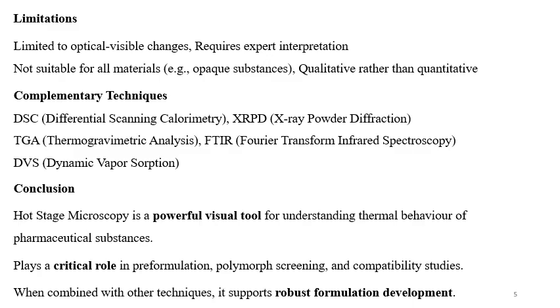It is limited to optically visible changes. It requires expert interpretation because it is a qualitative type of technique. So, the sample should be analyzed repeatedly, and it requires expert interpretation. It is not suitable for all materials. It is qualitative rather than quantitative.